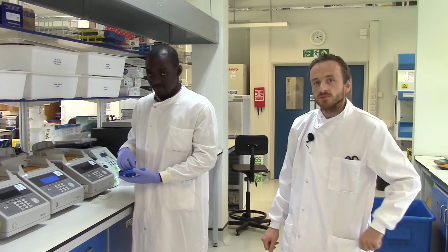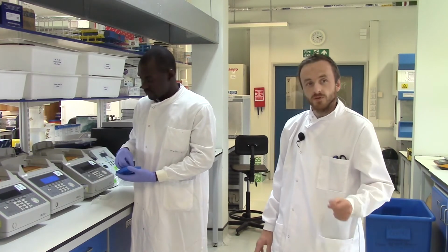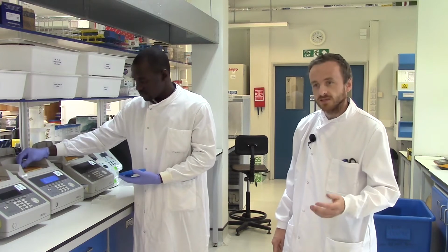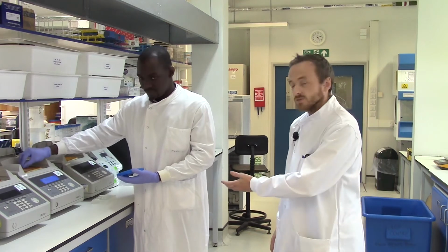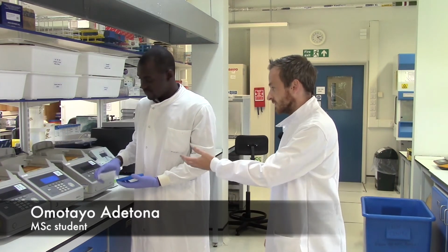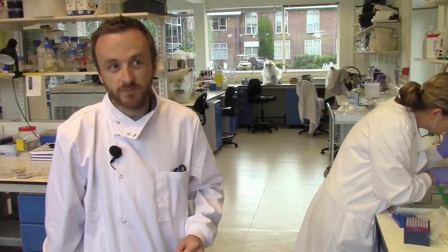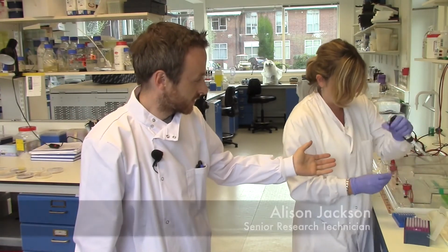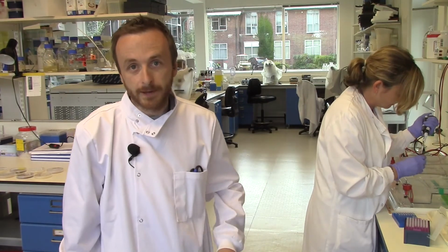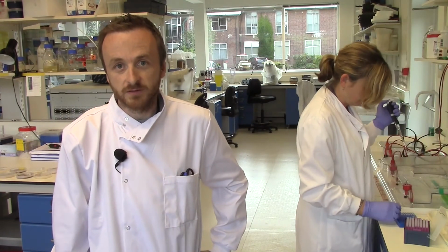So in our lab we use molecular techniques for identification of plant pathogens. So we can take infected samples from a field, extract the DNA and identify pathogens through PCR, which is what Teo is doing here, loading samples into a PCR machine for molecular identification. Following the PCR, we run the samples out using gel electrophoresis, which is what Alison is doing here, loading the samples on the gel. It separates the DNA based on its size, and then we can go on to identify the pathogen.